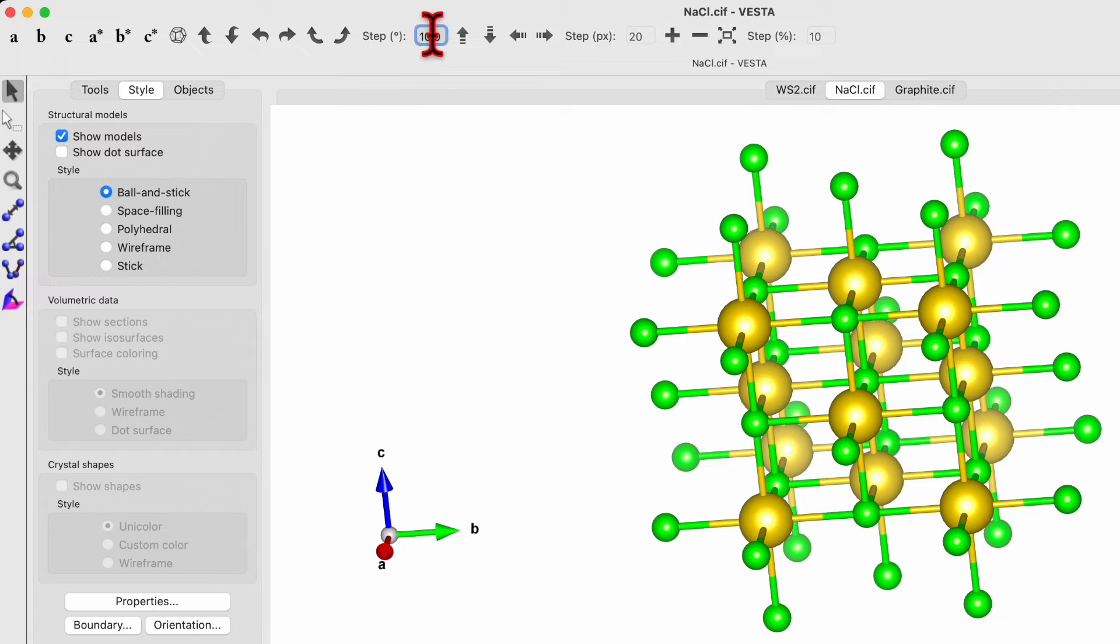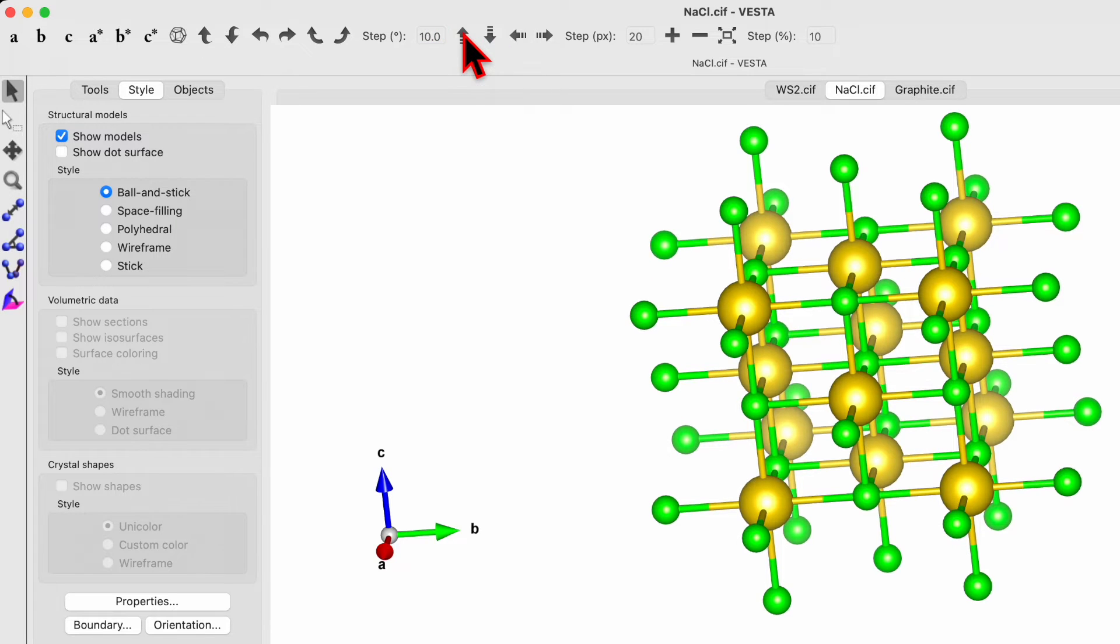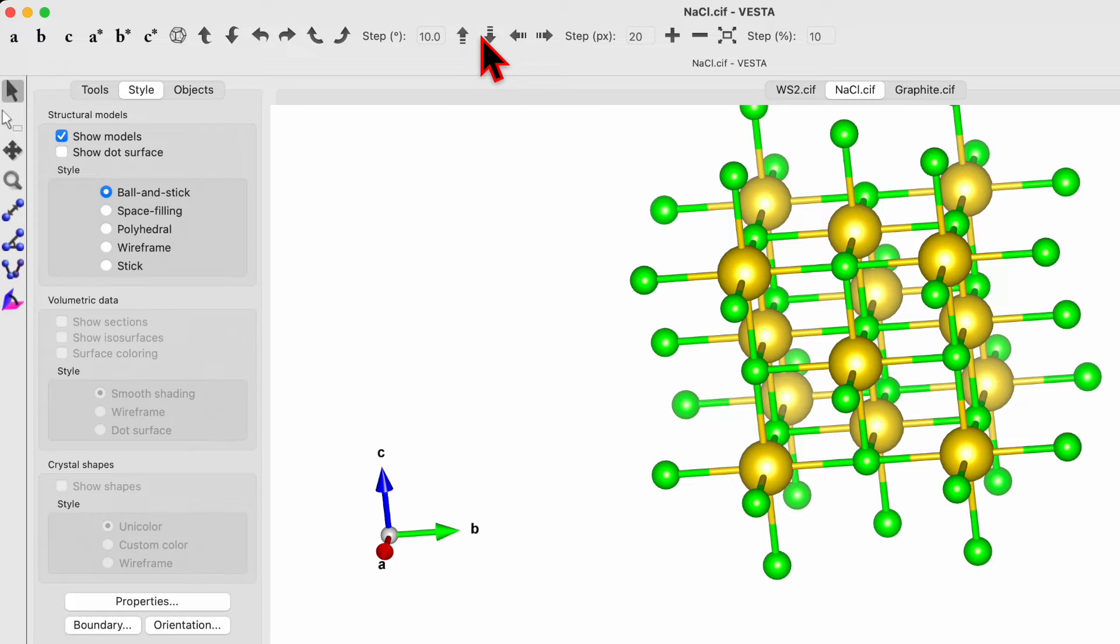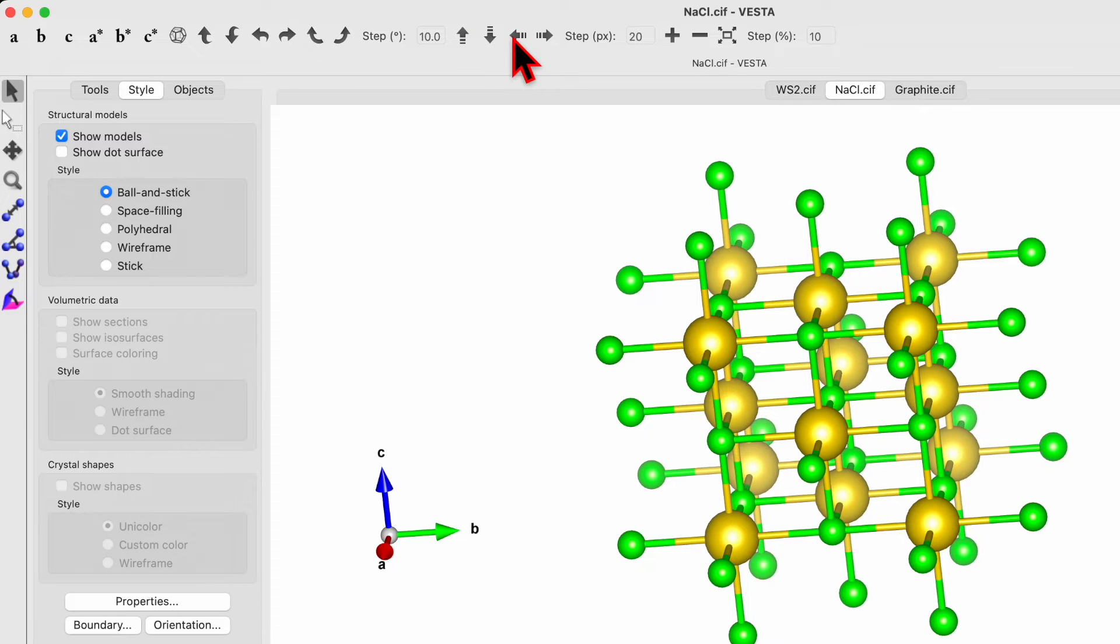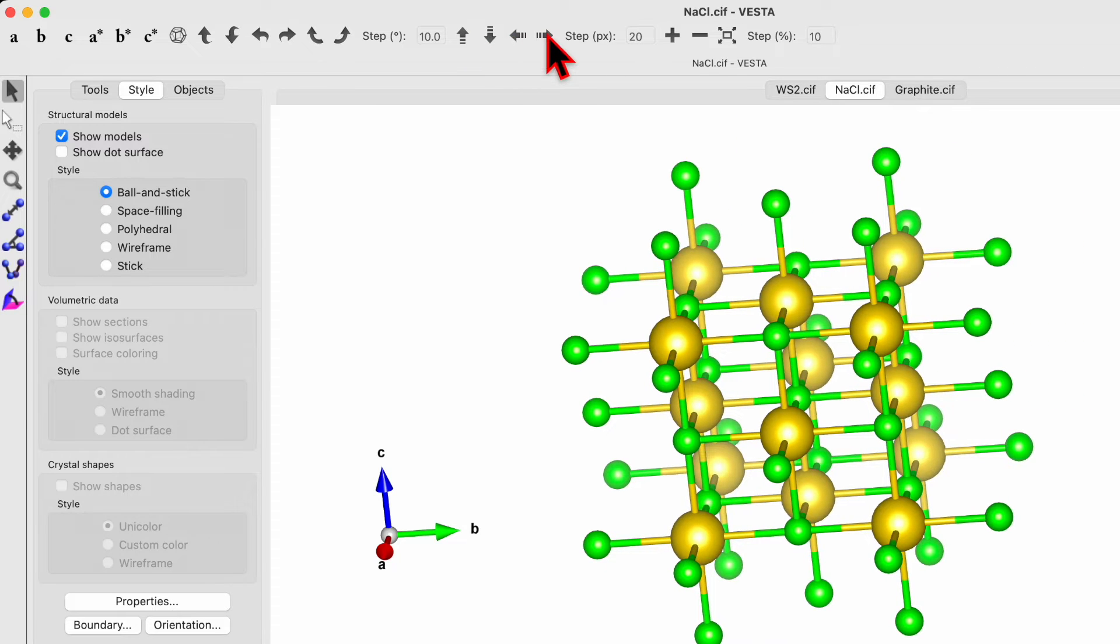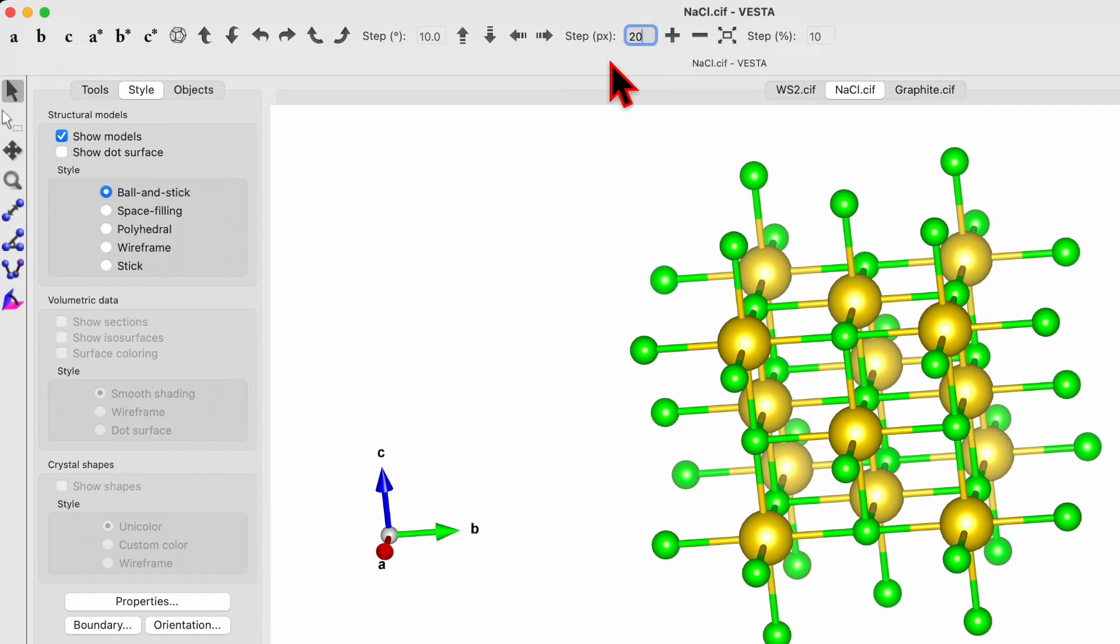Then we got these four arrows over here. These arrows are translate upward, translate downward, translate toward the left, translate toward the right. Again, the translation step can be changed by changing this number.